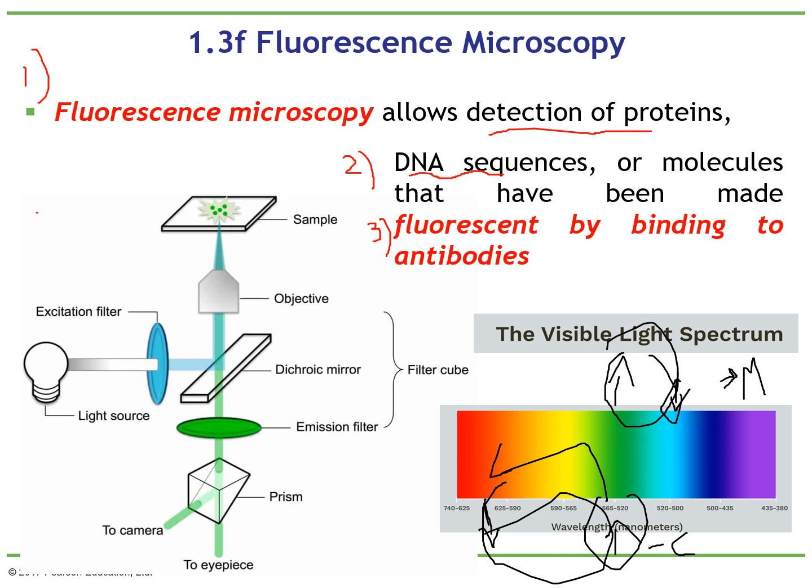Finally, the last thing that I wanted to show you is the different steps. And in the video, you already saw it. So just to remember, in the beginning, what happens here is that you have a light source. This light source in the fluorescent microscope is not going to be white light, it's going to be a laser with a specific light. In this case, the excitation light will be blue, and it has to go to a filter, so it doesn't go everywhere.